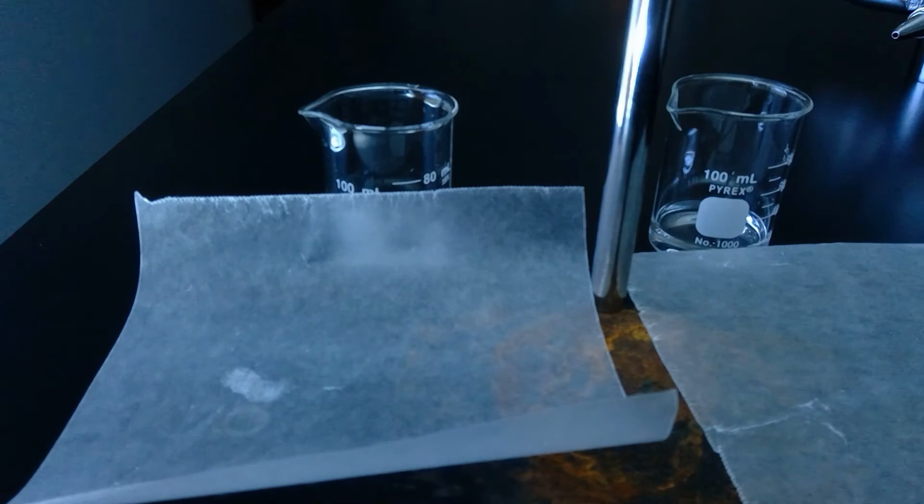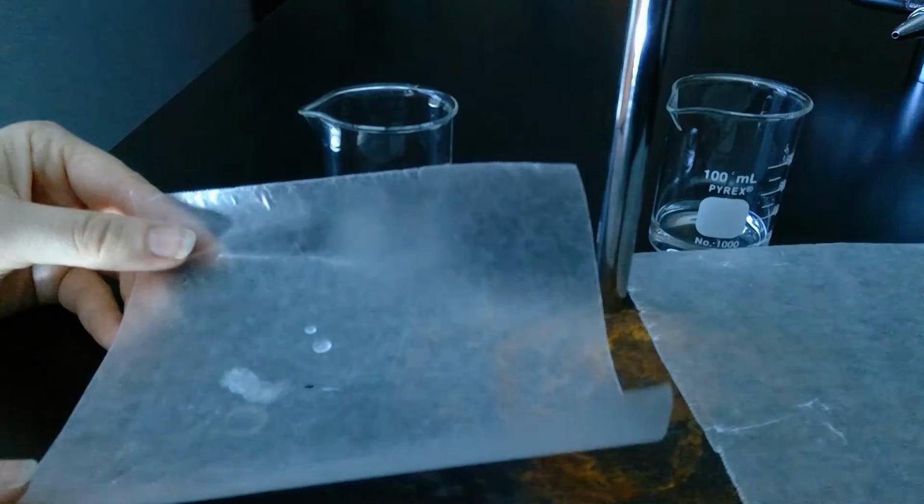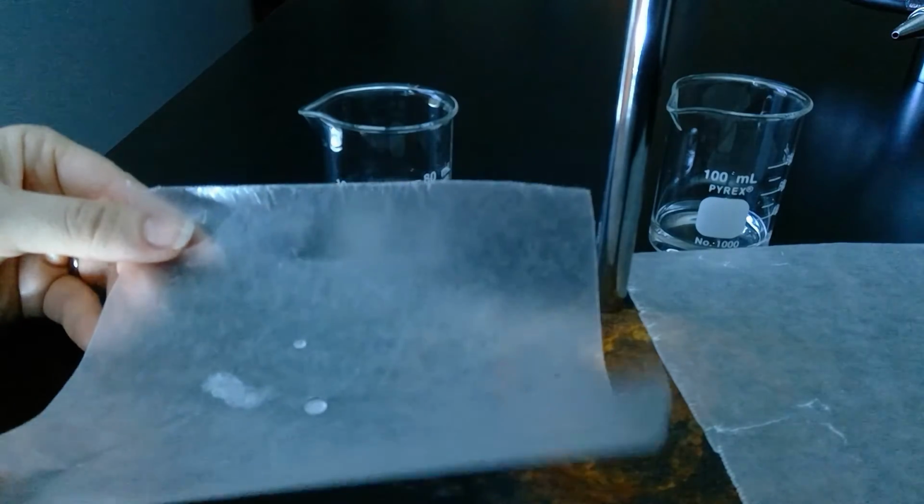Next, we're going to test our 4 liquids on wax paper. We're looking to see if the drop stays rounded or if it flattens out. So you can see with our water, this stays as a nice round drop.